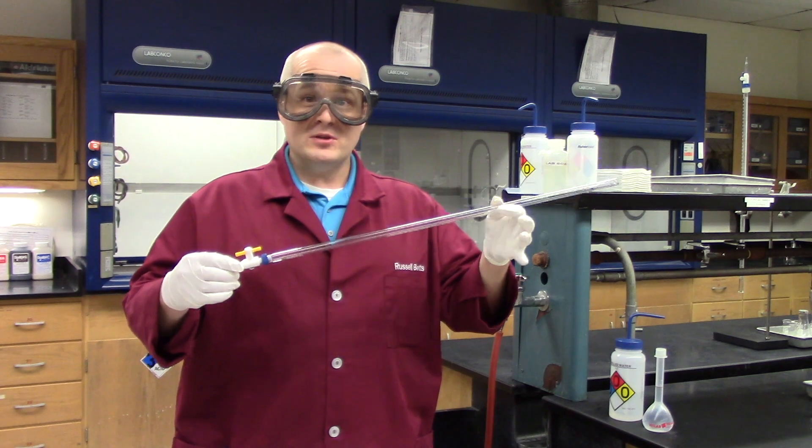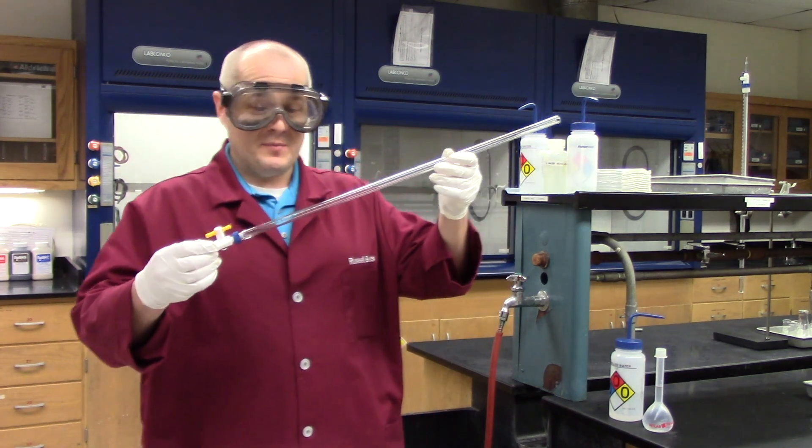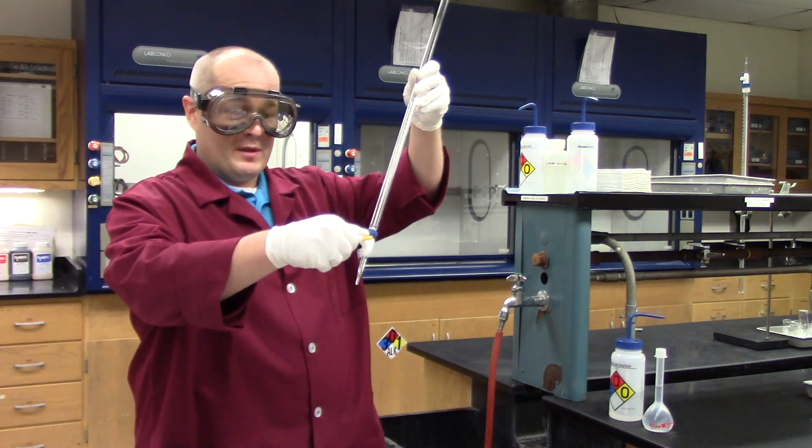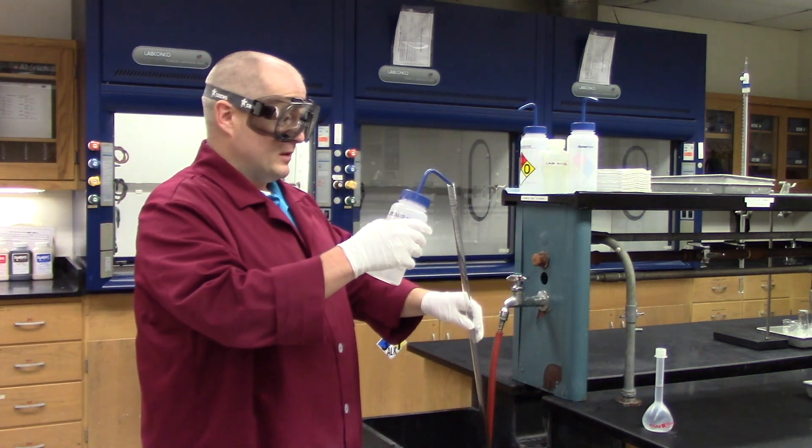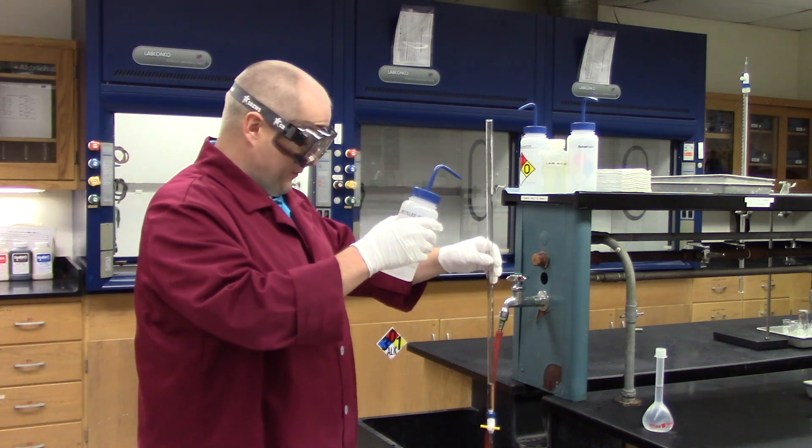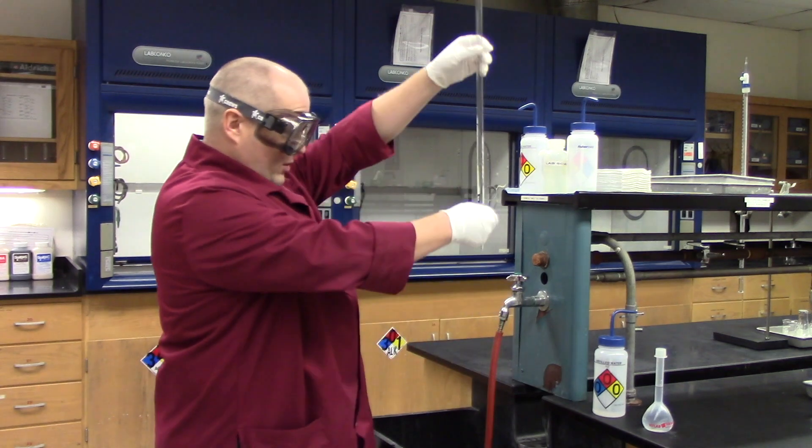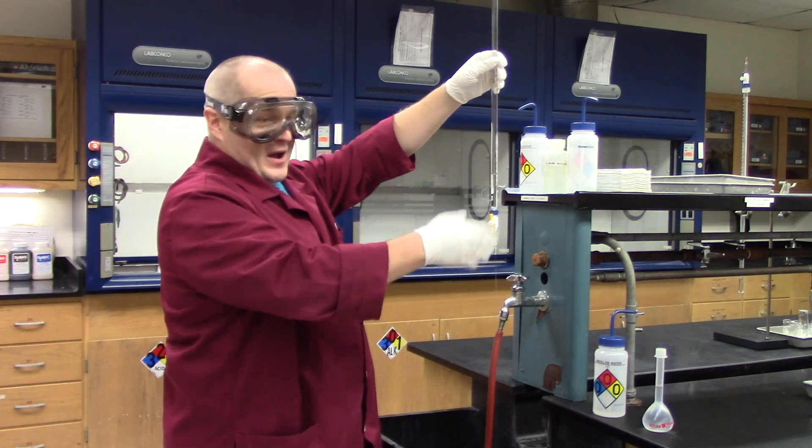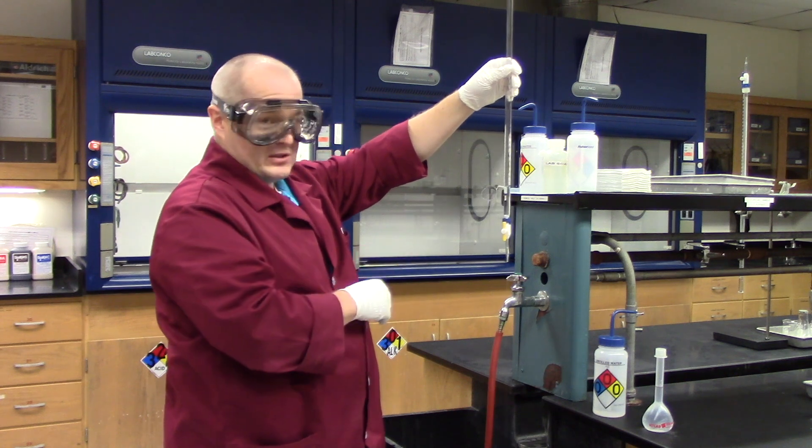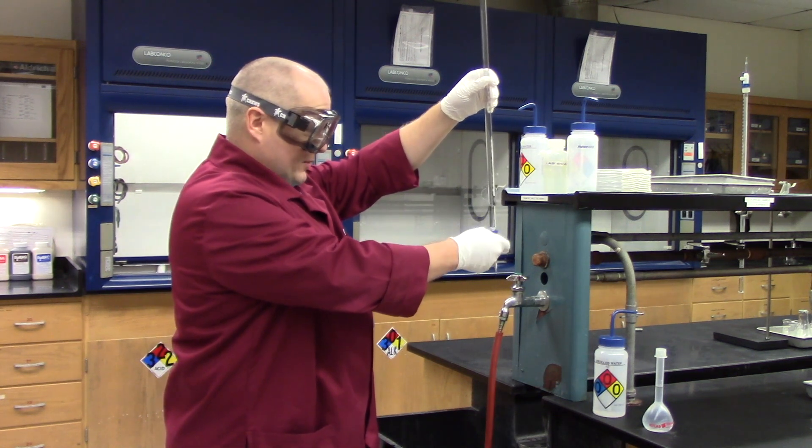Now we will show you how to rinse the burette and put your antacid solution inside of it. To rinse the burette, simply take the stopcock and put it in the closed position. Take a squirt water bottle, squirt a little bit of water in there, between five and ten mLs. Open the stopcock and let a little bit of water run out of the bottom. You are trying to rinse out any impurities or dust or whatever that may have gotten into your burette. Once you have let a few mLs run out, close it back up.